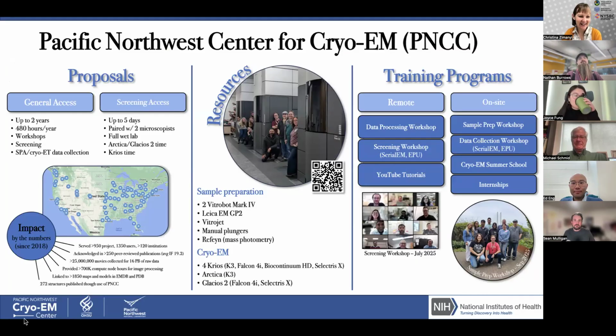Thank you. Hi, my name is Sean, and I'm a microscopist at the Pacific Northwest CryoEM Center in Portland, Oregon. PNCC accepts 2 types of proposals, screening access and general access. Screening access proposals allow you to come on site for up to 5 days to work on sample preparation and screening with PNCC staff. This proposal is aimed at low resource institutions.